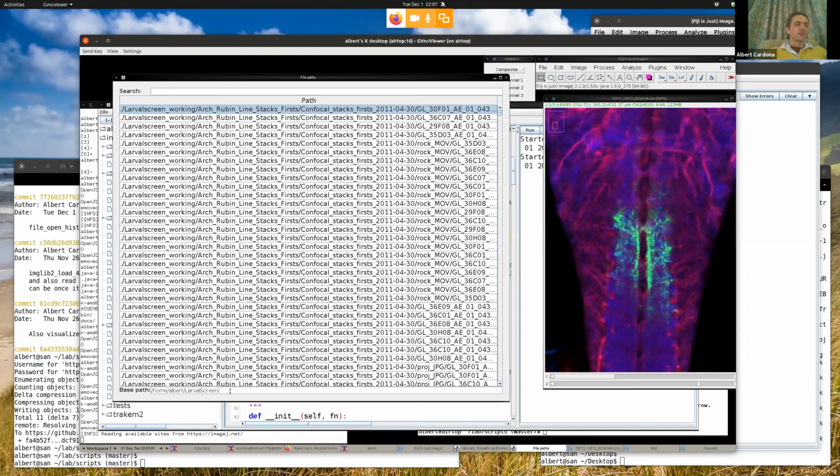And so this means depending on where you mount your remote file share, the first part of the file path will be different in your laptop, in your desktop, in your coworker's computer. Everybody will mount this in a different place. And so if you generate these file paths as relative, in order to open them, you need to tell it, okay, relative to what? And this is what this base path concept means. So in here is the home Albert Larval screen. This is where I mounted this file share that contains tens of thousands of files.